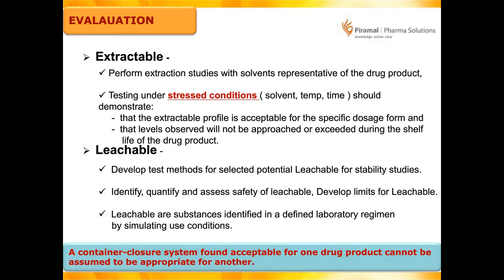There might be other non-aqueous solvents present in your drug product. So the extractable study is mainly dependent on what is present in your drug product. It is not about the rubber stopper. It is about your drug product. What is inside your drug product? What is the vehicle? What is the medium which you are using?